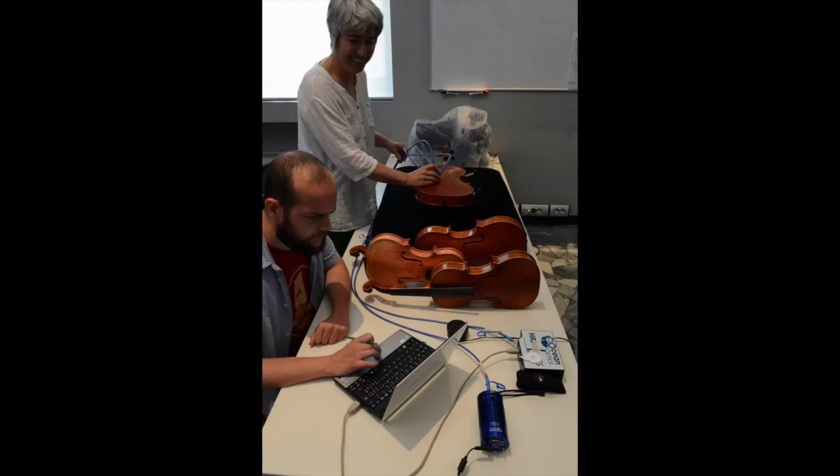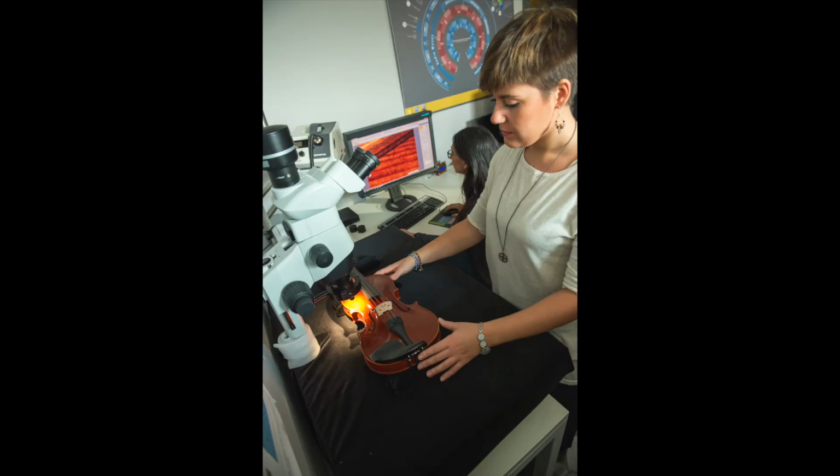We are here now in the Arvedi Laboratory for non-invasive diagnostics, and our laboratory is located in the Museum of Violin in Cremona, where one of the most important collections of bowed stringed instruments is held. The aim of this laboratory is to analyze and study materials used in the making of mainly violins, but we also analyze and study other classes of musical instruments.